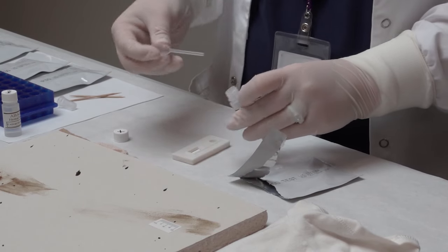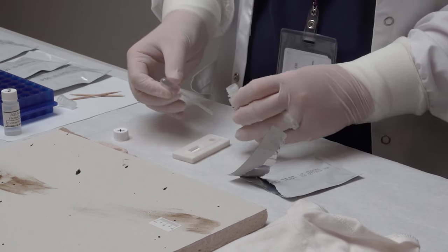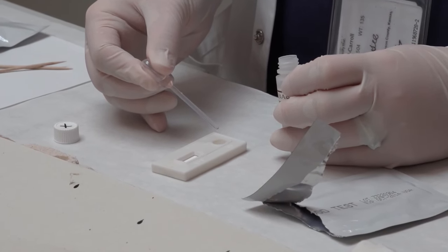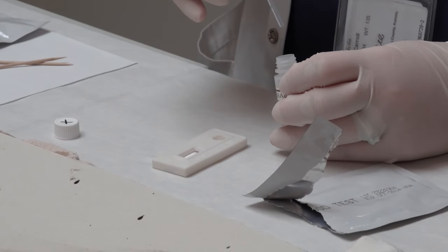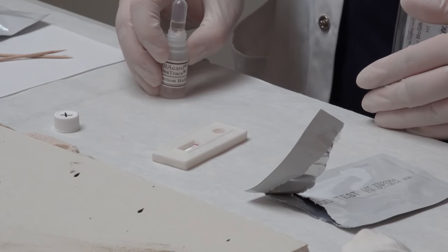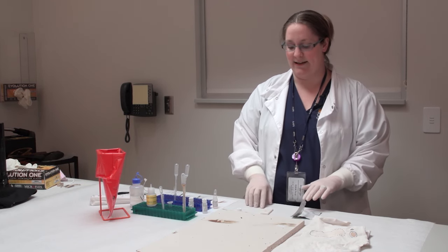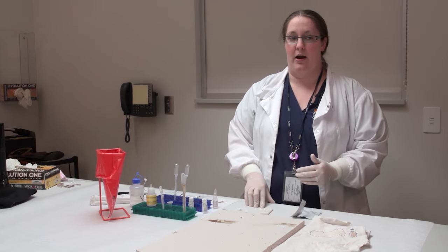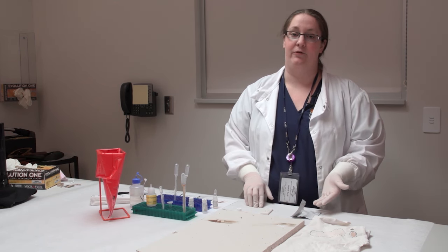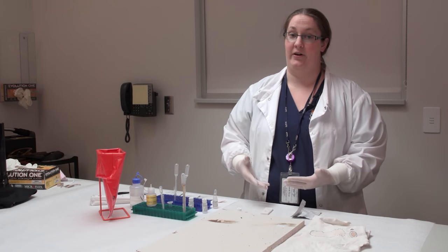I'll open this up, fill my pipette full of the extracted blood, and just add it to the end of this cartridge. Much like a pregnancy test, if you get two lines it's a positive reaction, and if you only get one it's a negative reaction for human blood. This test takes a few minutes to run. If you see a positive result immediately, it's positive. But to call it negative, you'd want to wait a full 10 minutes and make sure that no second line formed on the card.